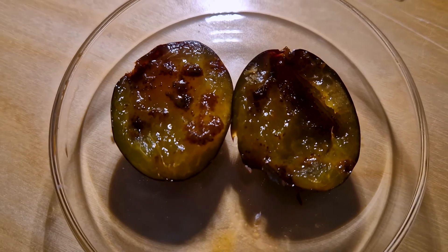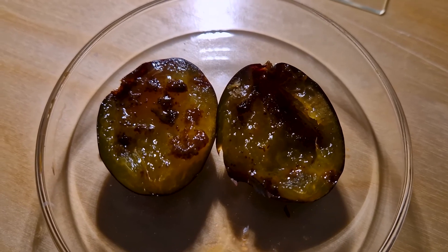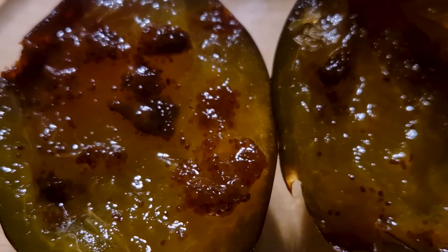But what, or rather, who is to blame for their gross appearance, you ask? Well, I will show you that in a moment. But first, let's look at the skin and flesh of a plum under the microscope.